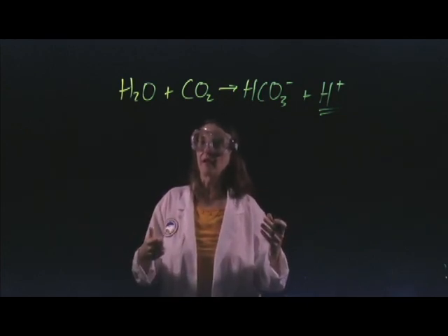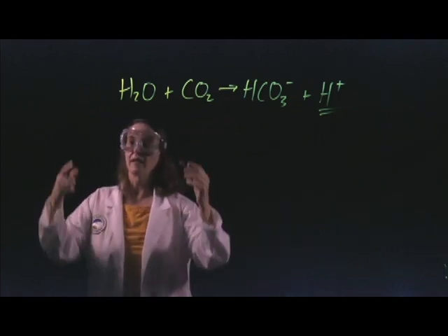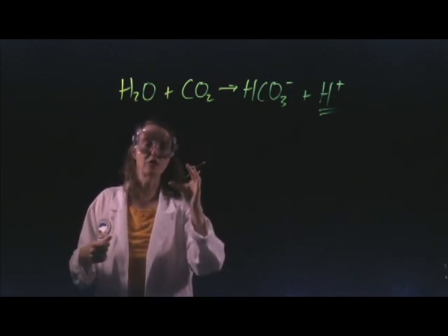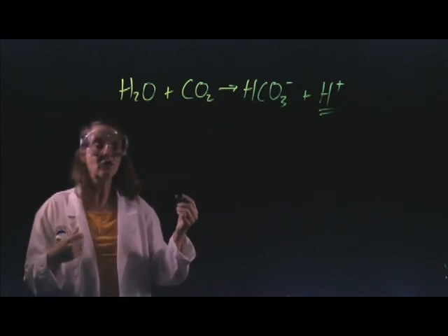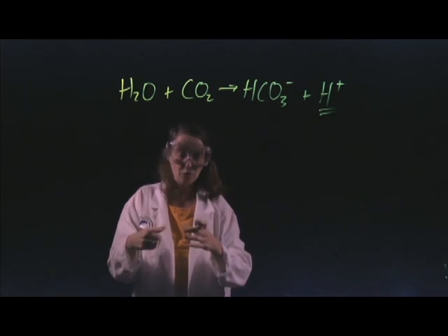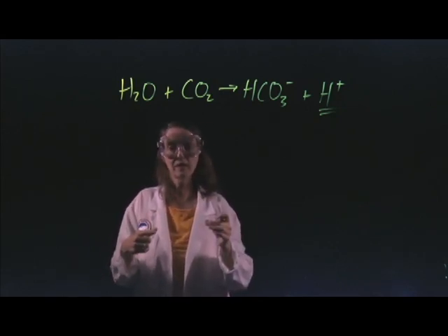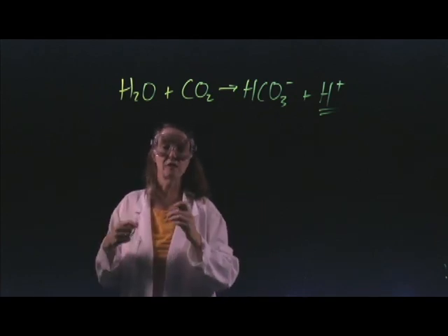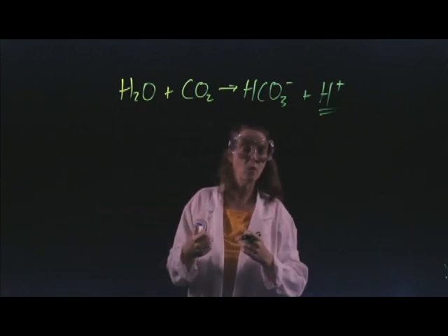In part 2 of the lab, you are going to look at acetic acid, which is a weak acid. And you should see an acidic solution when you just have acetic acid and water. But you'll add a buffering salt to it. And once you have your buffer system set up, you'll add some strong acid and strong base to it. You should be able to compare the effect of a buffer system to what you saw in the non-buffered water that you had done in part 1.